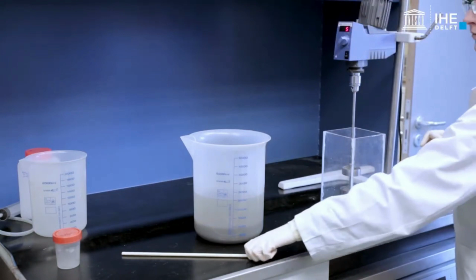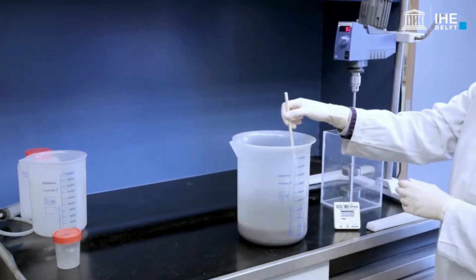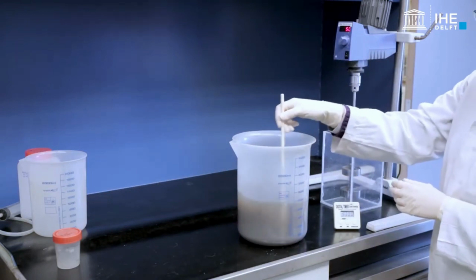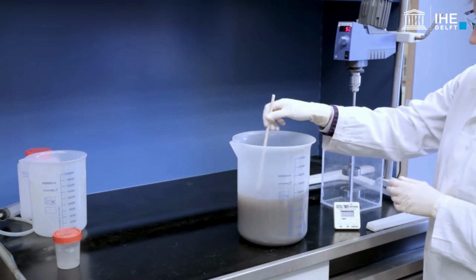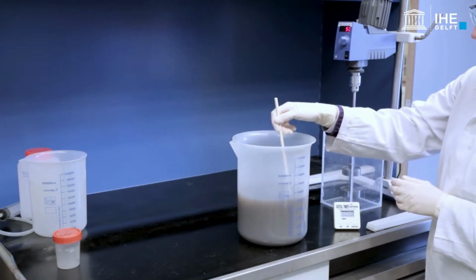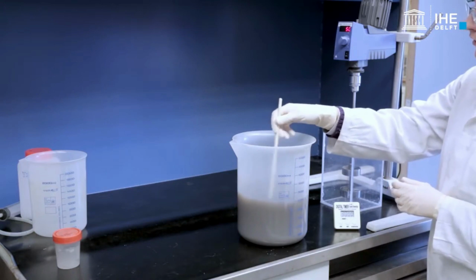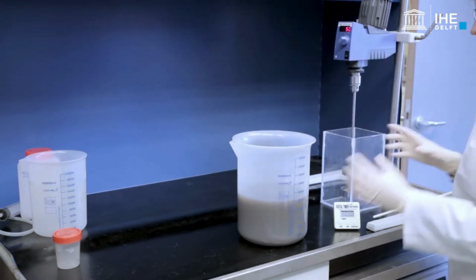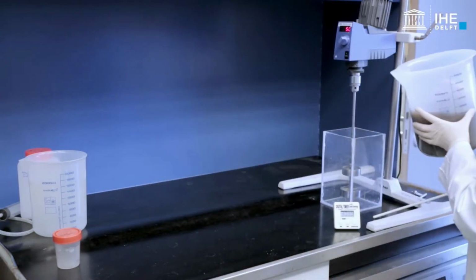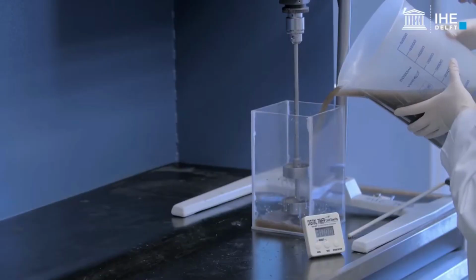The activated sludge sample is collected from the activated sludge tank. To start the experiment, stir the sludge sample with a stirring rod, and pour this sample slowly into the flocculation jar.